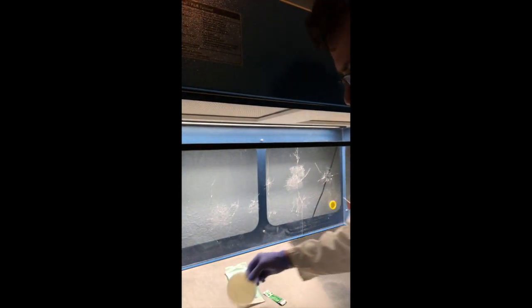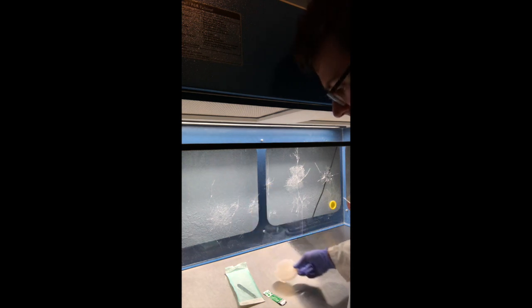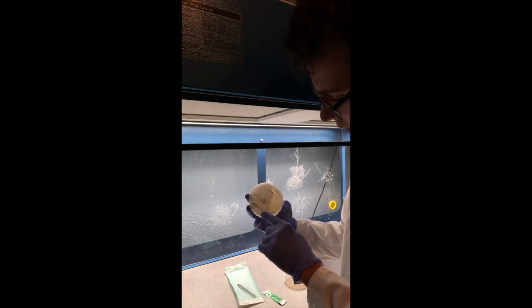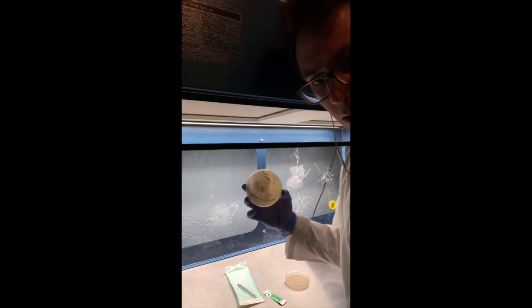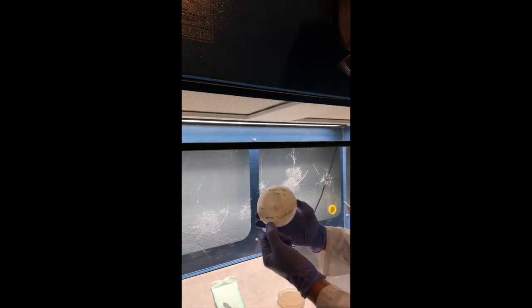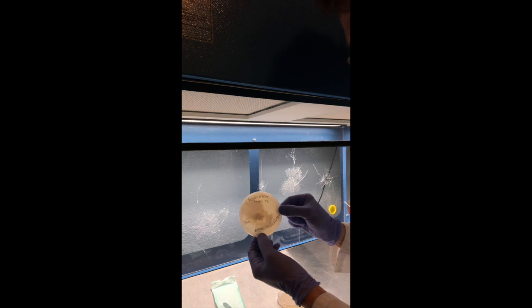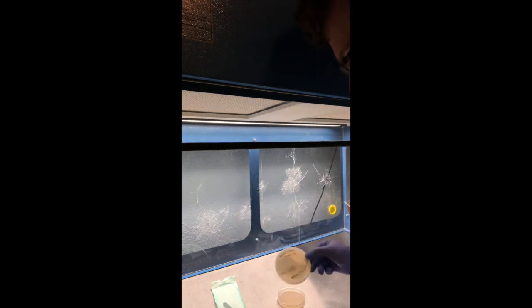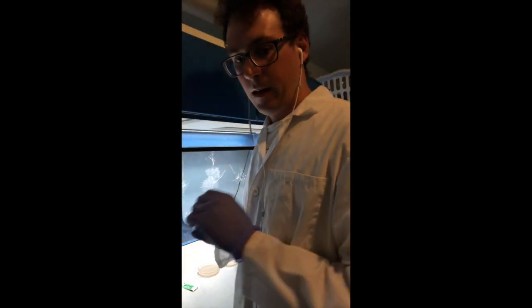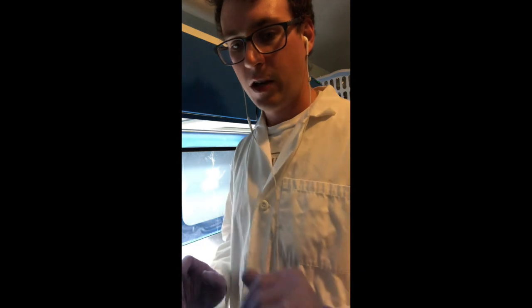I'm going to be starting off with a malt extract agar plate and this culture of local oyster mushroom. I'm going to set up the phone so you can see more of the technique I'm using. I cleaned out the hood, and that's the most important thing. So now I'm going to begin my transfer procedure.